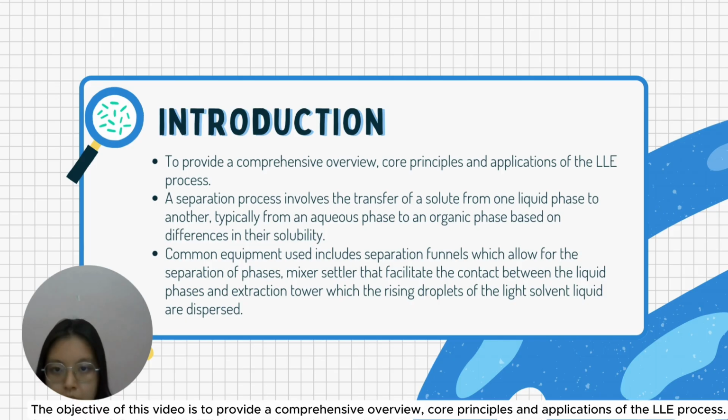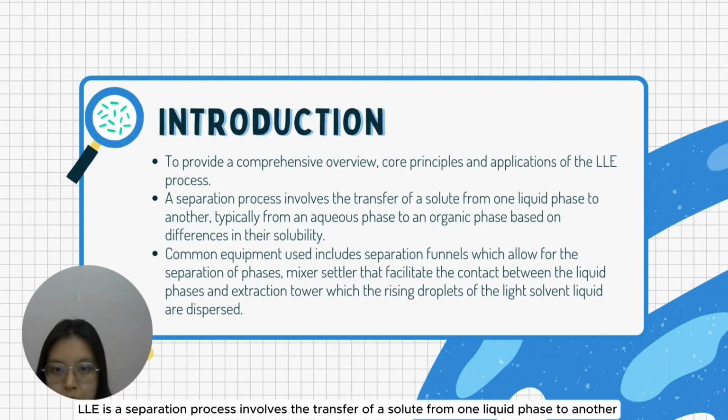The objective of this video is to provide a comprehensive overview, core principles, and applications of the LLE process. LLE is a separation process that involves the transfer of a solute from one liquid phase to another, typically from an aqueous phase to an organic phase based on differences in their solubility.